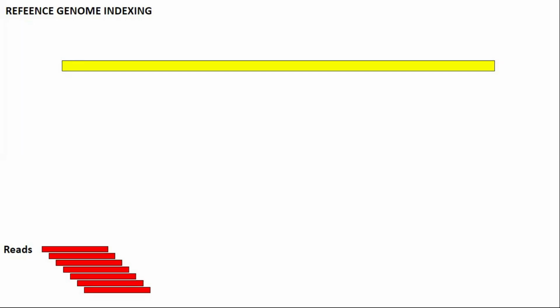So basically, we just index our entire genome, and we mention where a specific region is present, where specific sequences are present. Okay, and where that sequence starts from, and what the actual bases of it are. So we index it in an alphabetical order.